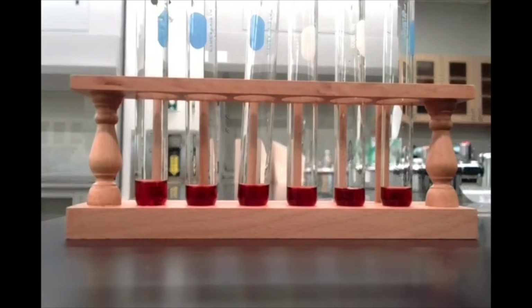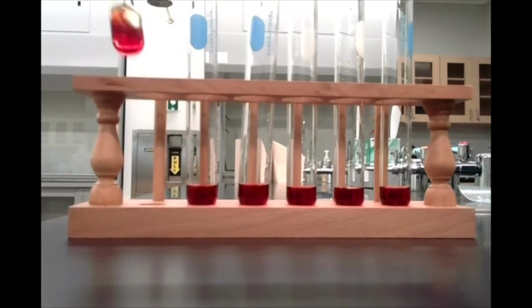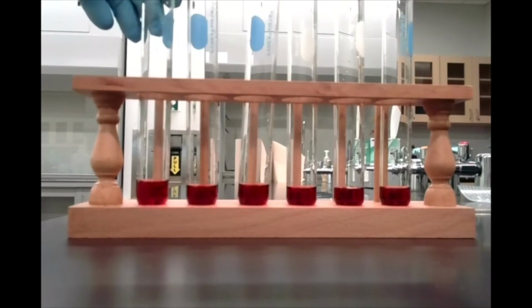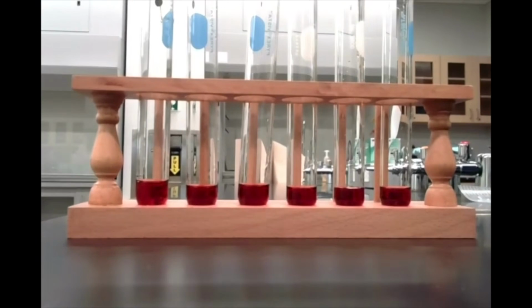So we have 10 drops of water there. Just going to shake that up a little bit. It slightly dilutes our solution and increases our volume obviously as well, but make a note of the color that we've got here. I'll leave this up so we can compare colors for all of our subsequent test tubes that we're going to add different chemicals to.